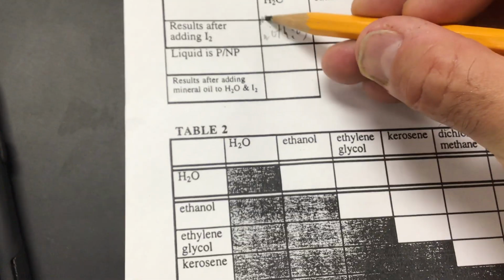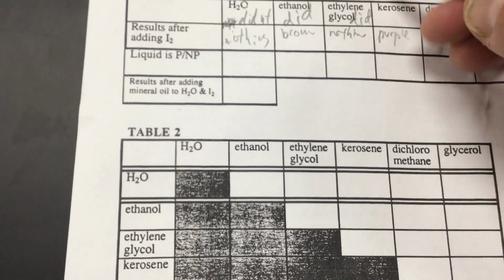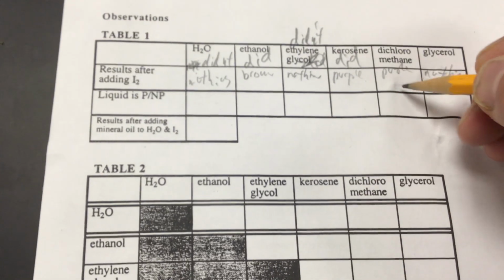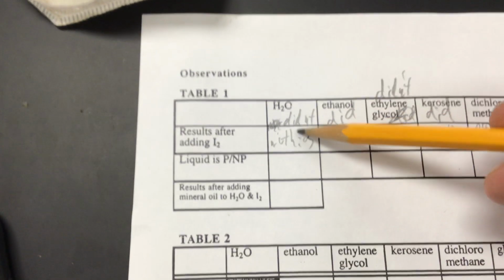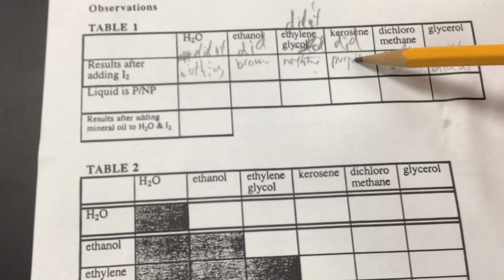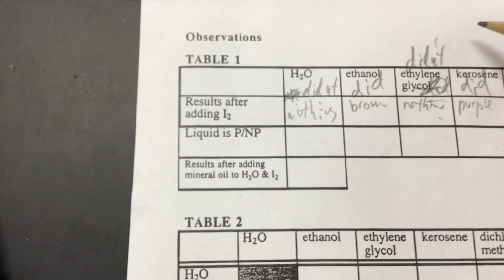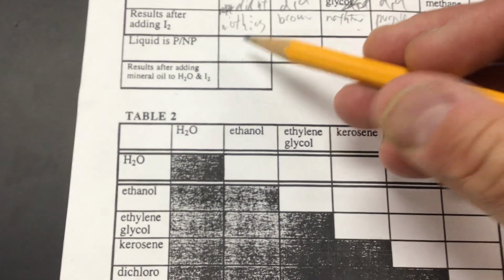So the first one didn't mix, the second one did. The glycol did nothing. The kerosene did mix. The dichloromethane did mix, and the glycerol did not. So based on your understanding of iodine, you should then be able to identify those as polar or nonpolar, okay?